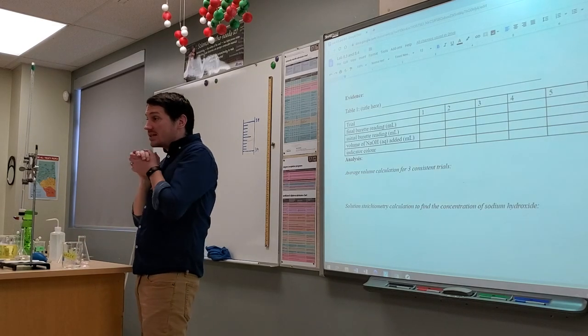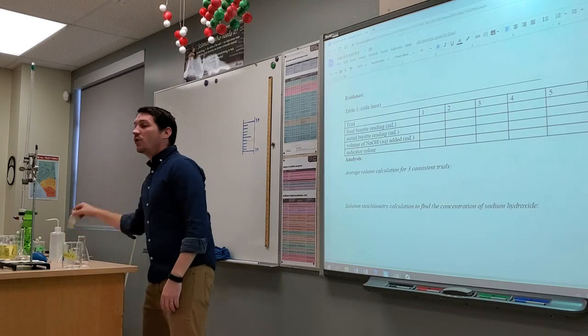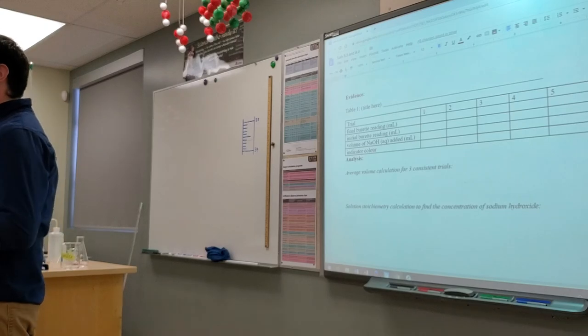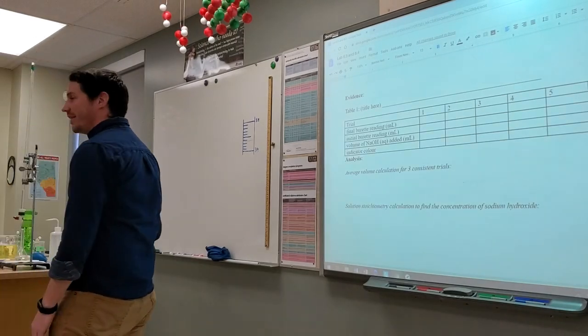Are we kind of okay with this? Yeah? Okay. Please don't forget to add your phenolphthalein. Because what happens if you forget to add your phenolphthalein? You'll never see a color change. And that's going to suck.